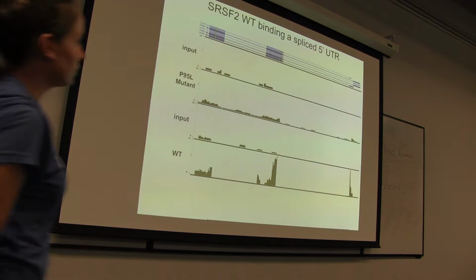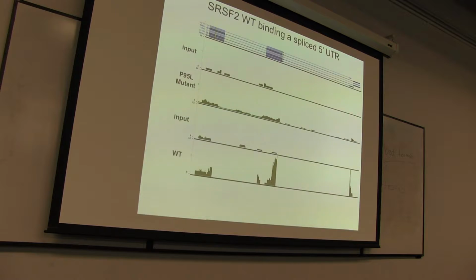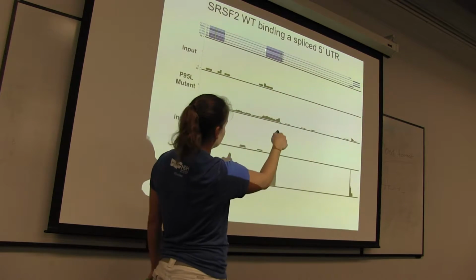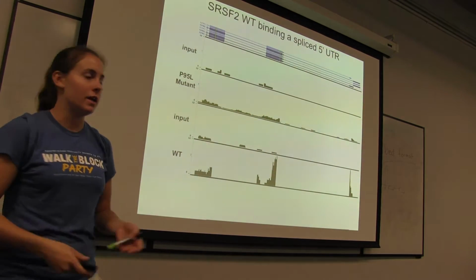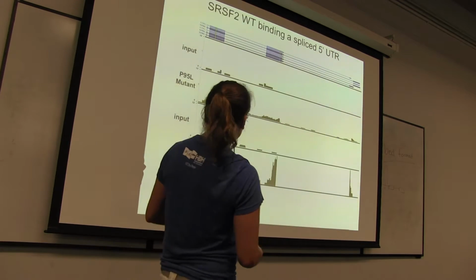So this is an example of, that's a very poor example, of what a typical binding data set looks like when you're looking at the reads and you get these peaky regions. Remember we talked that this kind of data set is not RNA-seq because we would see big drastic fall-offs around the exons. But instead, when you're doing binding profiles of either RNA or DNA, you get these very peaky regions of where a particular binding site would be.